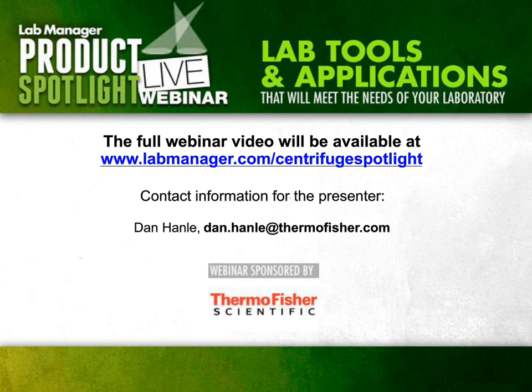And I'd say over the last 10, 15 years, that's been an issue with microplates. Microplates came along fine, no problem. I want to spin it. At first, they were very low Gs, and now there's all these applications with higher Gs, and we've had to innovate and get these different support systems in place so that you can spin these microplates at faster and faster speeds, or higher Gs, while not doing damage to them, but getting a good separation. So in those situations, it's like a collaboration between us and the end user and the application they have.